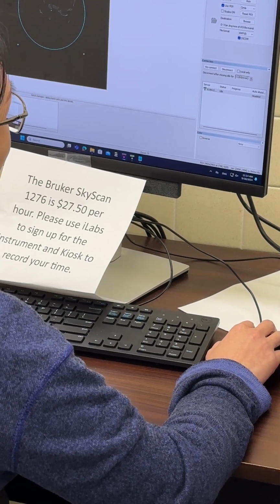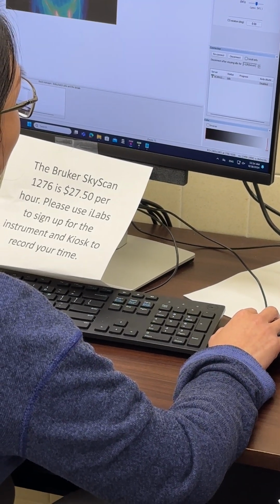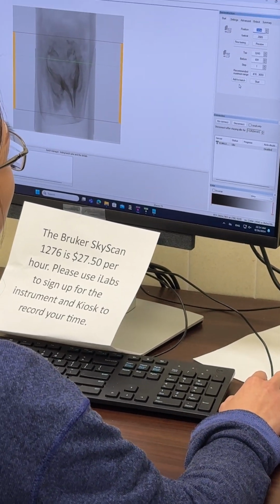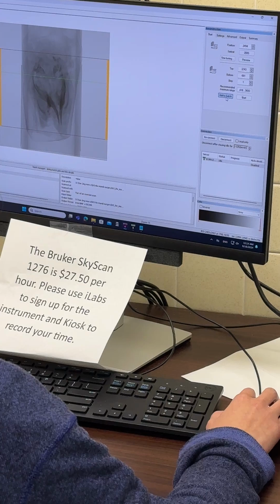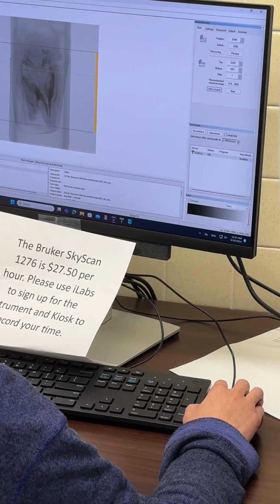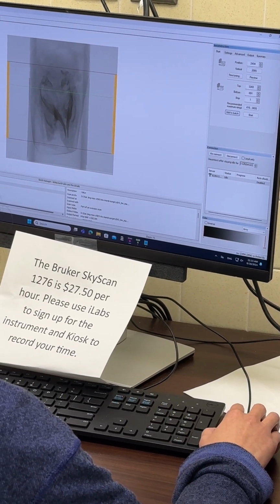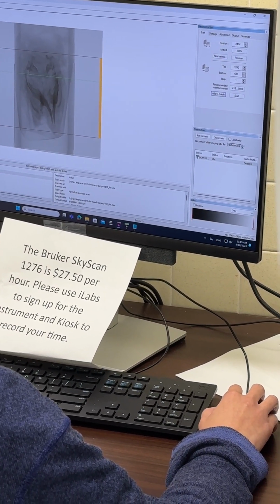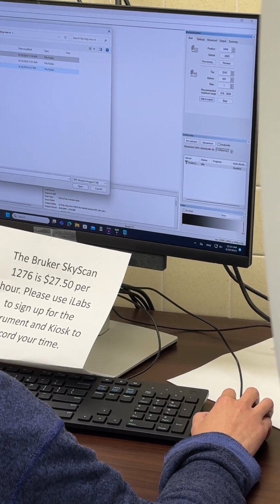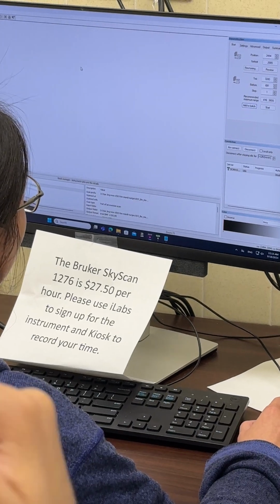Where is it? Oh, here, start. Add to batch. So this setting will be, okay, set it here. So when we start to submit the batch, it will start all the other samples. So right now we can open the other one. Aim 8. So randomly pick one.